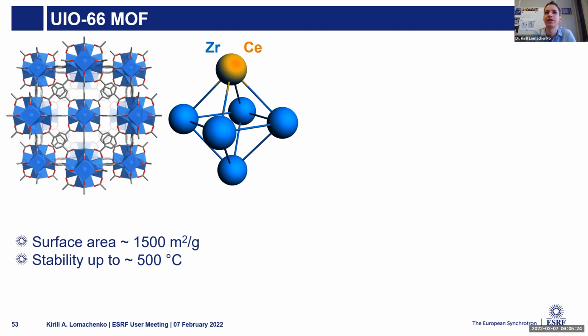What makes it different is the bond distances, so you can distinguish between them. Of course, it will introduce more complexity in the fit because you will have more inequivalent sites. So it has to be dealt with on a case-by-case basis. The general answer is yes, but it will depend on the particular case.